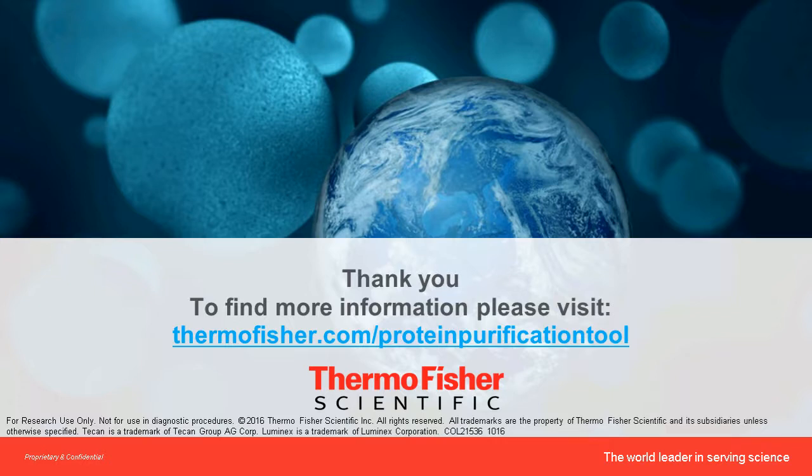So the differences in antibody specificity for the target accounts for a lot of times we say this antibody is validated for Western blot, but that may or may not work with the ELISA. So a lot of these targets, the differences we see are due to the different antibody used for different techniques. The IP-MS is the only technique that actually gives you specificity because you can actually identify the target in a mass spectrometer.